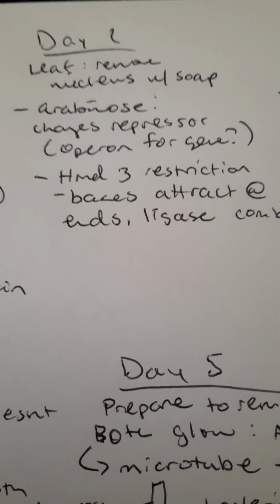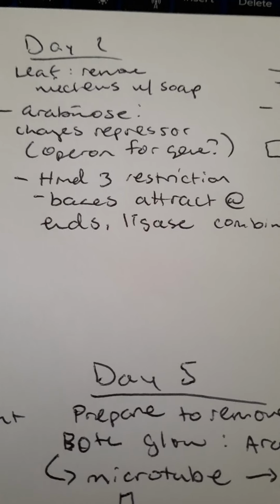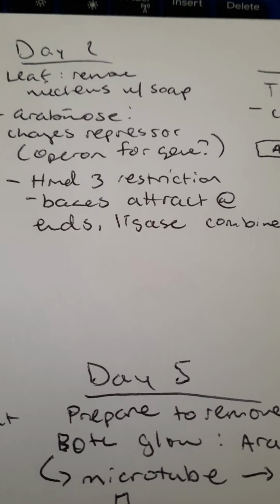Day two: there is a leaf, and we put that leaf in the solution, and we remove the nucleus with soap to get to the DNA.